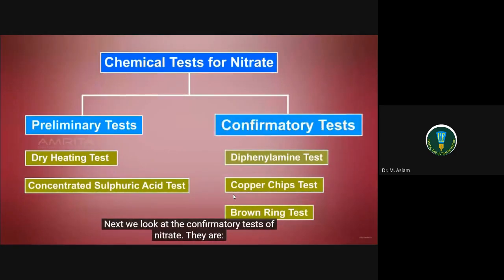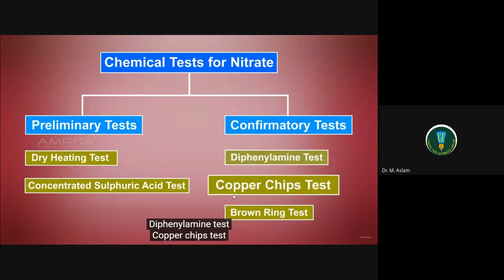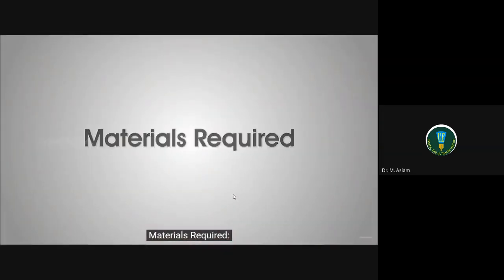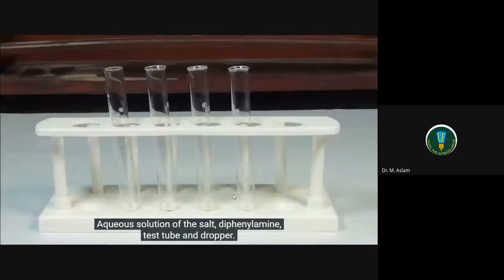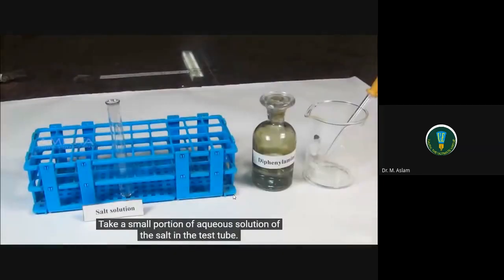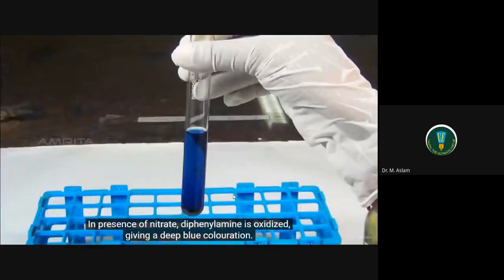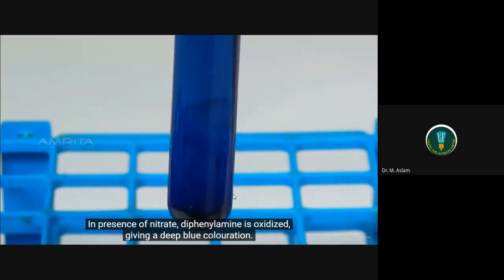Next, we look at the confirmatory tests of nitrate. They are diphenylamine test, copper chips test, and brown ring test. Diphenylamine test. Materials required: aqueous solution of the salt, diphenylamine, test tube, and dropper. Procedure: take a small portion of aqueous solution of the salt in the test tube. To this, add a small amount of diphenylamine using the dropper. In presence of nitrate, diphenylamine is oxidized, giving a deep blue coloration.